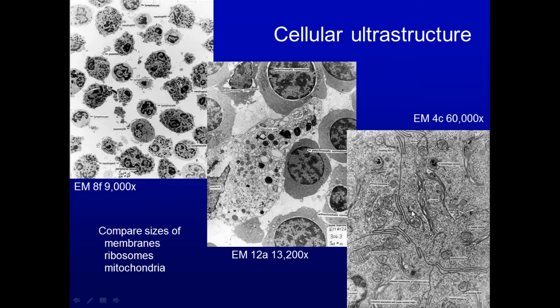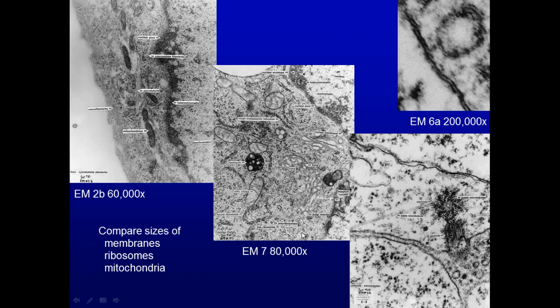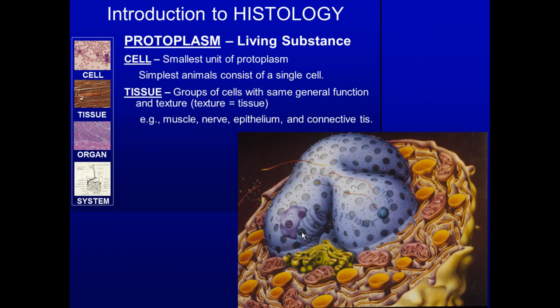So you can see mitochondria, you can see the Golgi apparatus, you can see lamellar structure in a mitochondria, you can see the nucleus. There's a nucleus here, a nucleus, these are lymphocytes in through there, and then these are monocytes that we see there. These are red blood cells developing in through here, and there's a nucleus, so that's heterochromatin and euchromatin. Heterochromatin, euchromatin, that we're seeing in these cells.